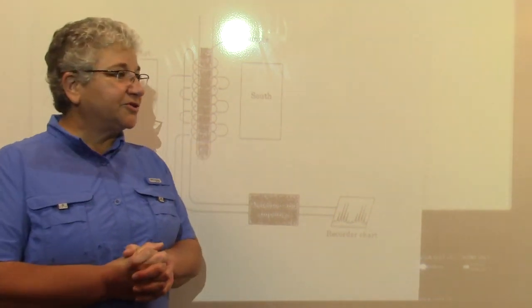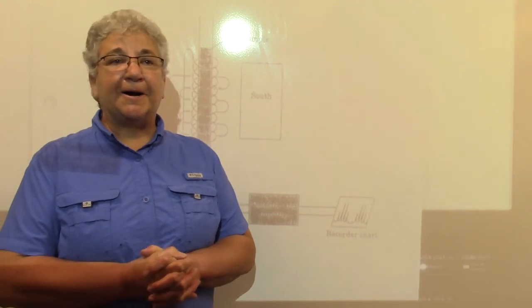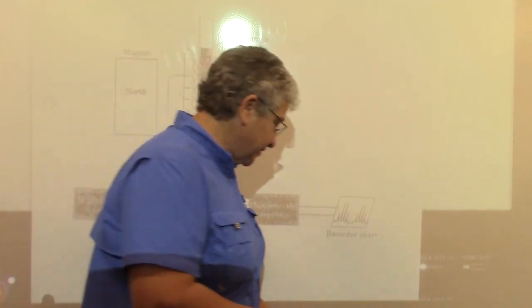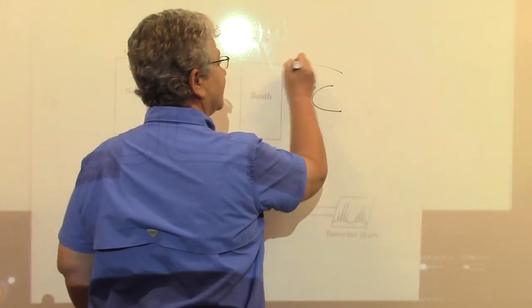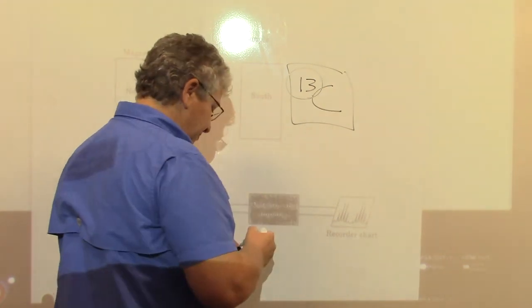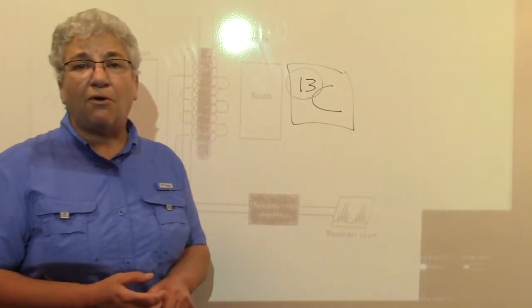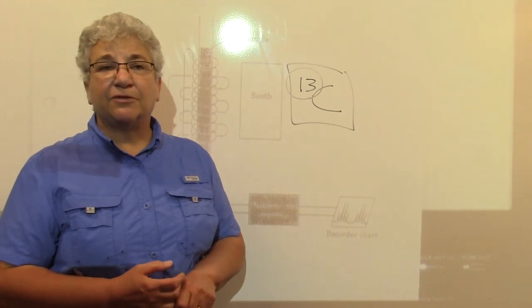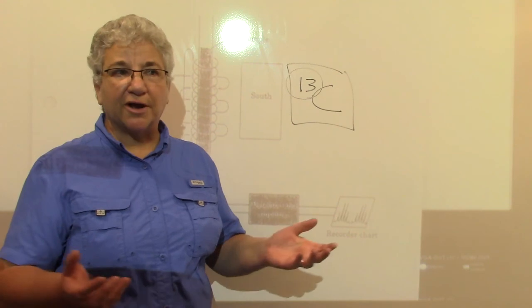So we will start by talking about carbon NMR. And in fact, you will see that we always write C13, and the 13 goes up here. So hopefully you do know that the mass of almost all of the carbon atoms in the world is 12 AMU, or 12 grams per mole.